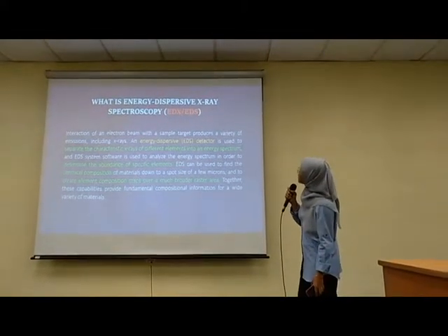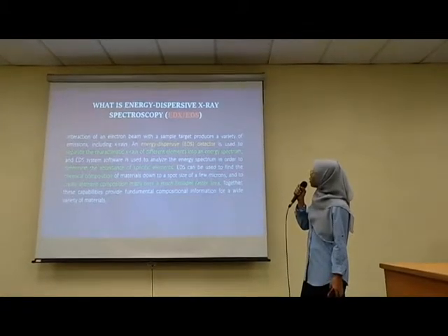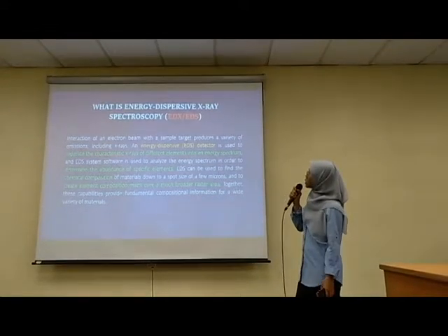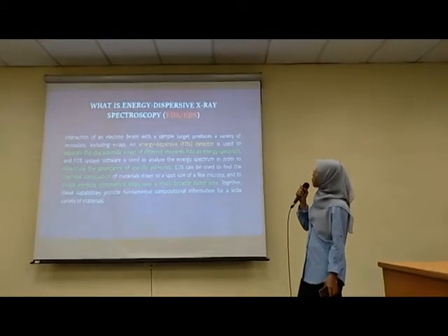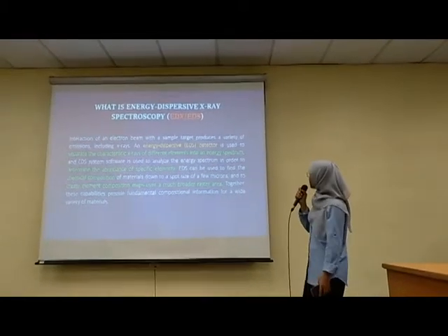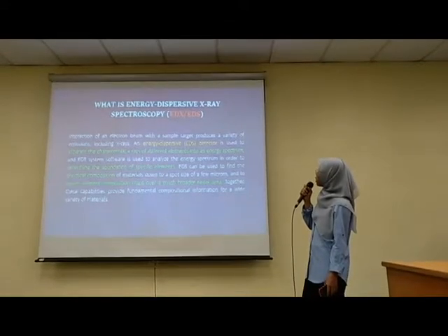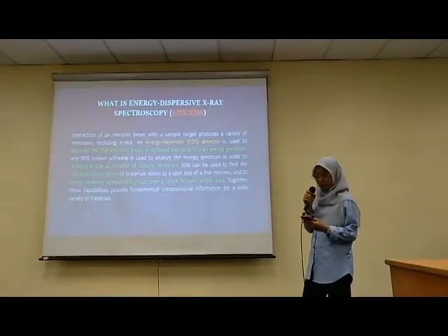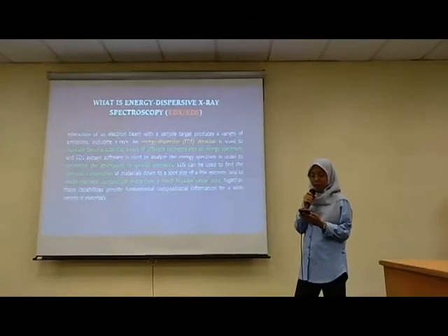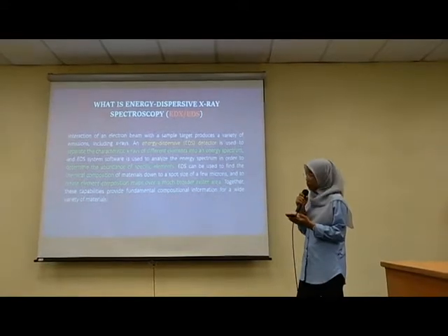What is energy dispersive X-ray spectroscopy, or we call it EDS? Interaction of an electron beam with a sample target produces a variety of emissions including X-rays, and this is used to separate the characteristic X-rays of different elements into an energy spectrum. It is also used for elemental composition, mapping of the elements, mass thickness of thin films, and to detect very small quantities.